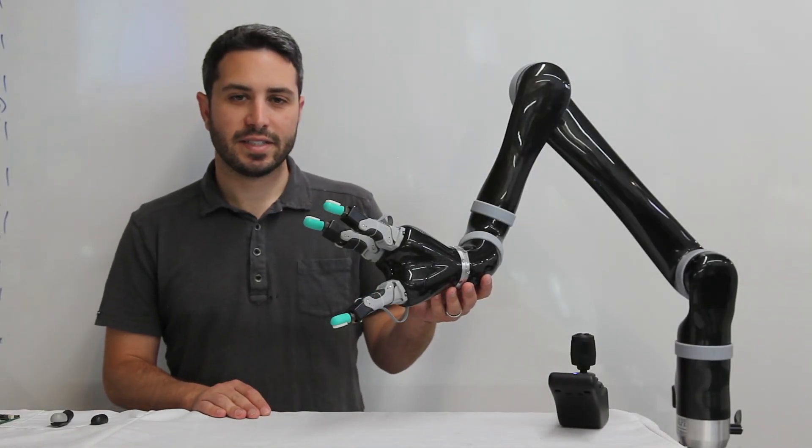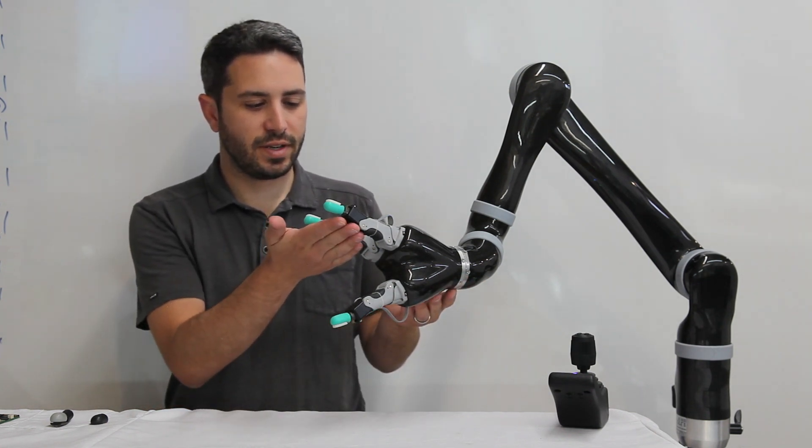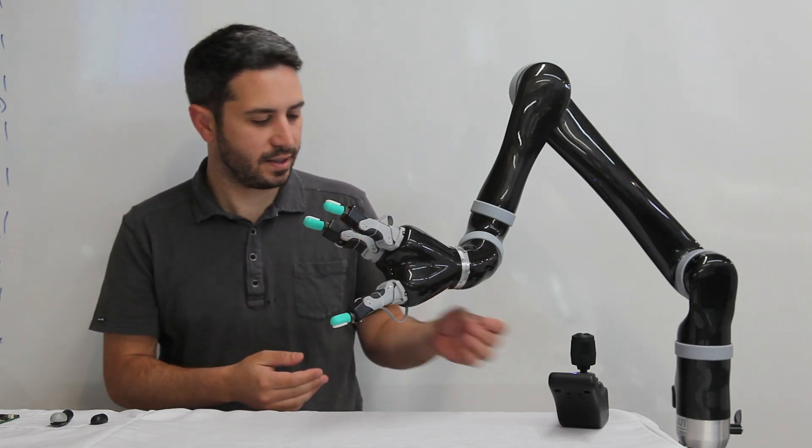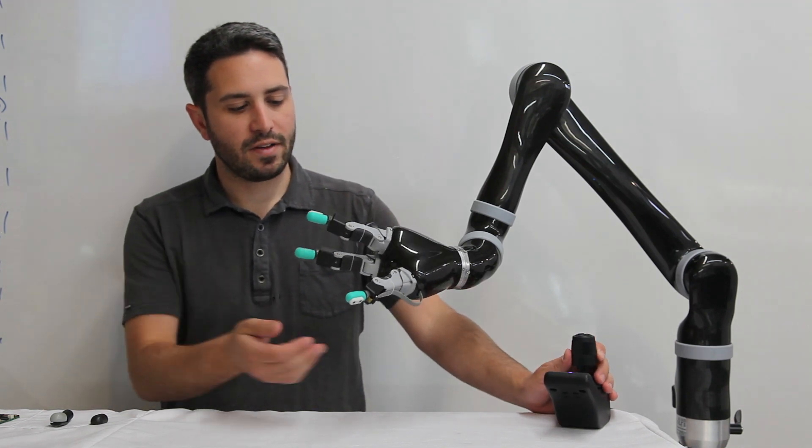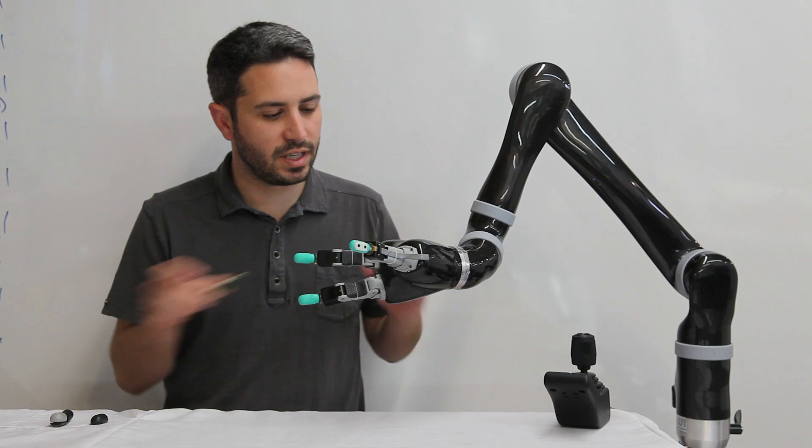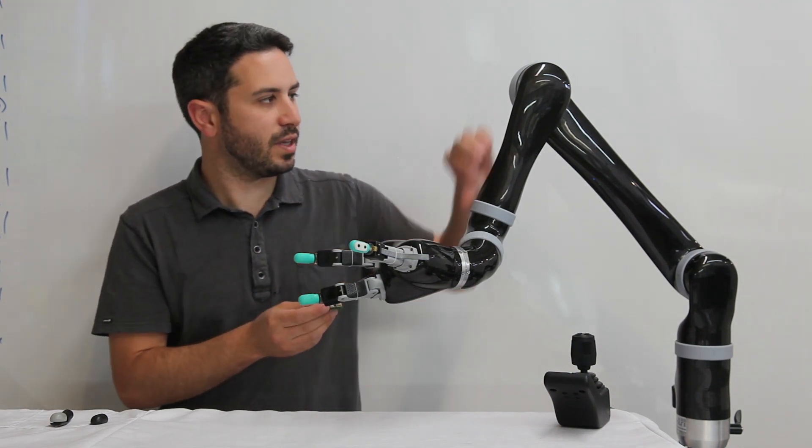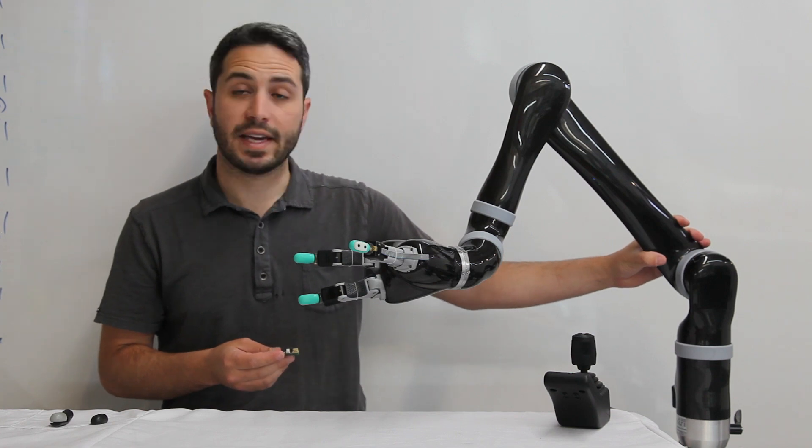So this is the Syntouch BioTac system for Jayco. It has three of our BioTac sensors located into the fingertips of the hand. We have all the wiring run from BioTac to inside the hand where there's an electronics board that collects the data and transmits it through the internal wiring via CAN bus.